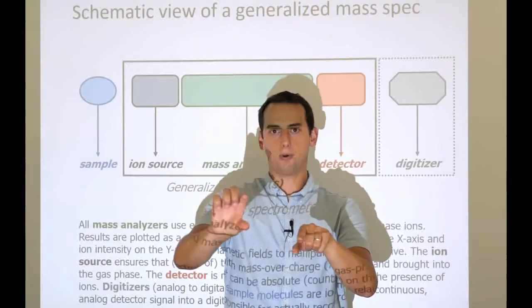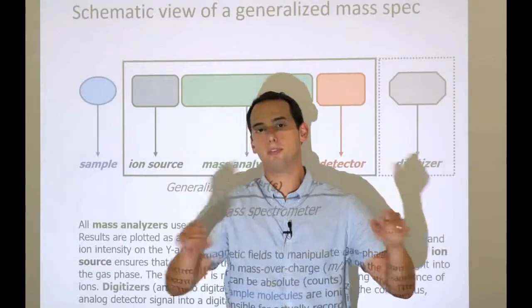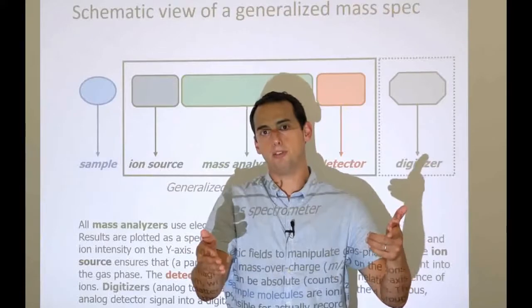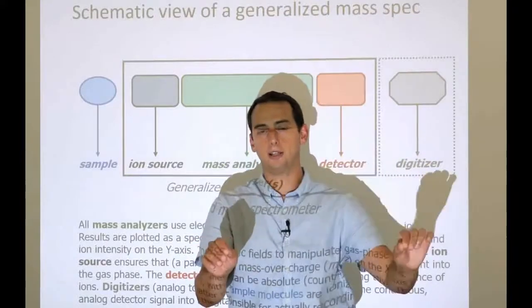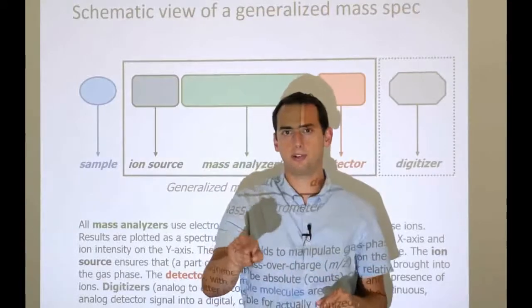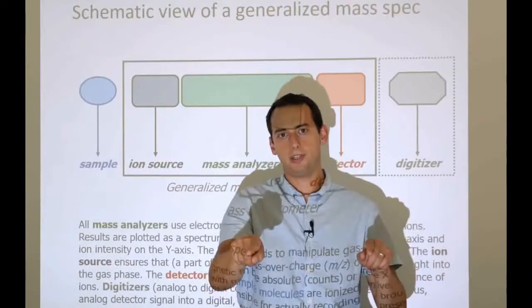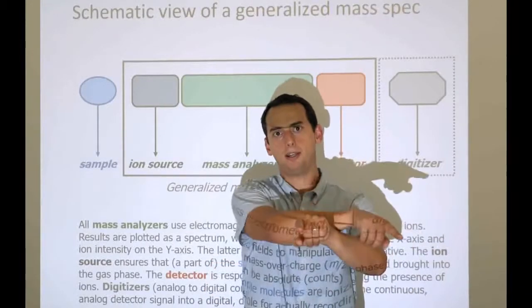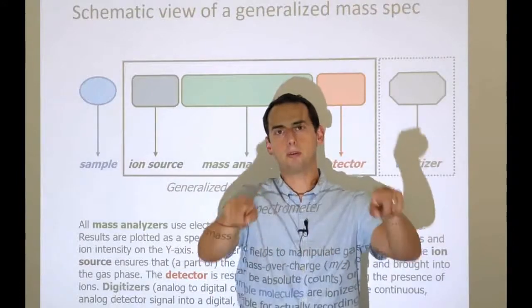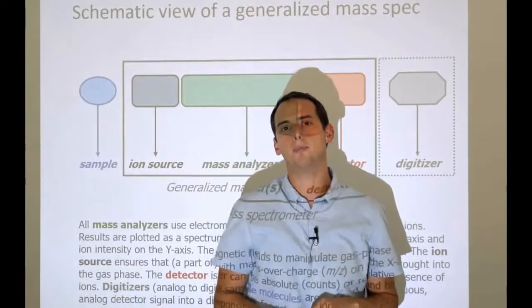It's going to measure a small amount, a large amount, and then a small amount again. And then the problem is, for this beautiful curve, we only have 3 points. So the closest approximation that we can do is just make a triangle out of this. Now, in this particular case, it's not too bad, but imagine if the original signal were like this, with a bump in the middle. Then we would measure it here, here in the bump, and here. And so what we would get is a very small signal, and we would be completely oblivious to the 2 peaks that flanked this valley where we had the measurement.